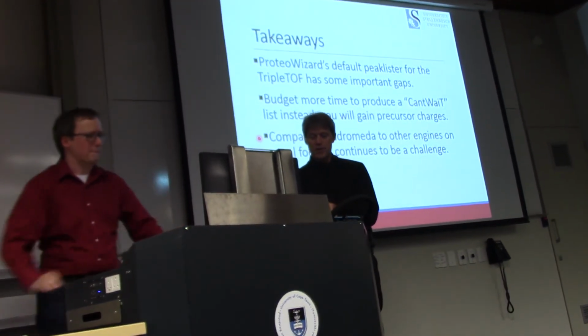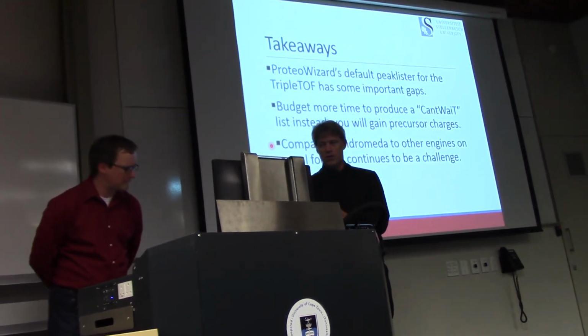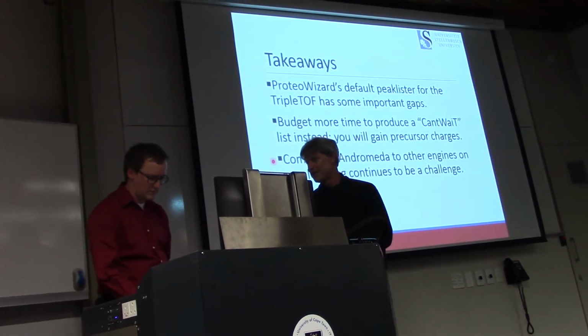Yes. Because one of the questions in my mind here is whether with the TripleTOF, we will see more proteins or simply more peptides for the proteins we've already seen.